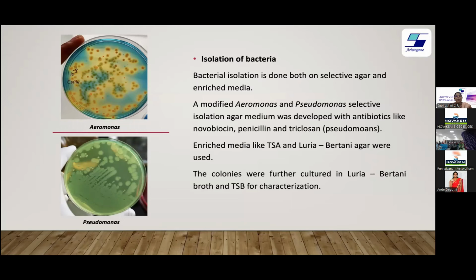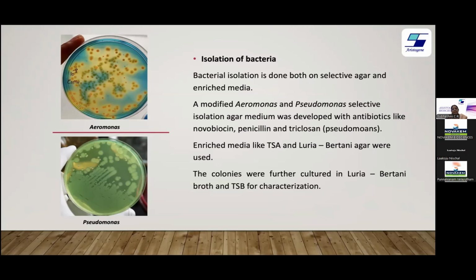Selective agars are the ones which will eliminate the other bacteria and selectively favor the growth of a particular bacteria. These are available from companies like HiMedia and other media companies, where you can buy the selective medium in which only Aeromonas grows, or selective medium in which only Pseudomonas grows. And many of these bacteria, say Aeromonas, are resistant to multiple antibiotics, which is a pathetic scenario today, which I'll come to later. Many of the Aeromonas isolated from fish or the diseased fish are resistant to several antibiotics. It could be penicillin, ampicillin, novobiocin, etc.